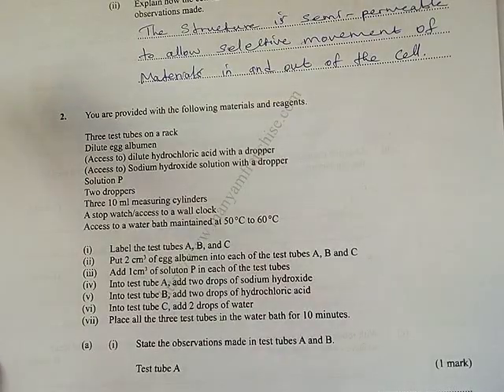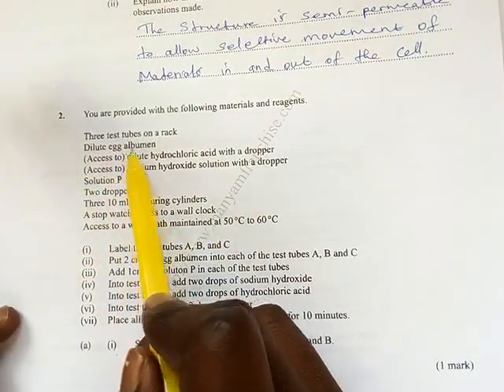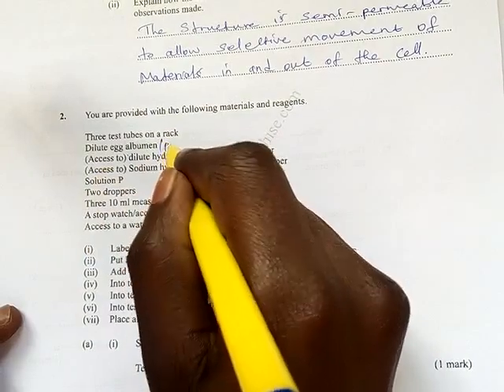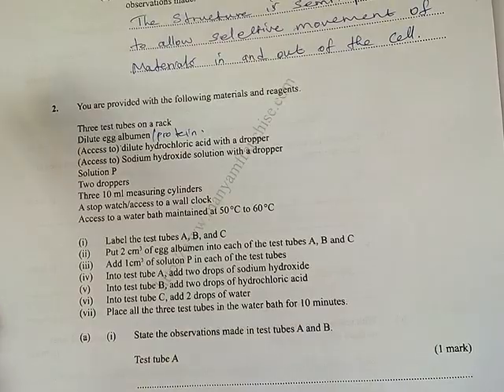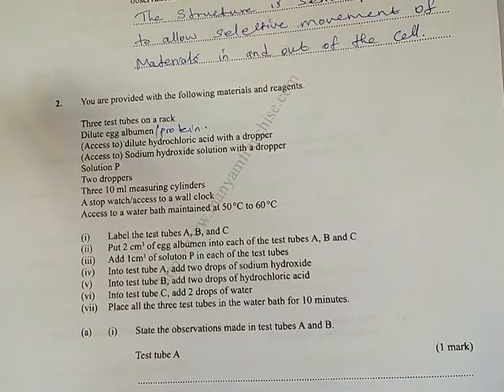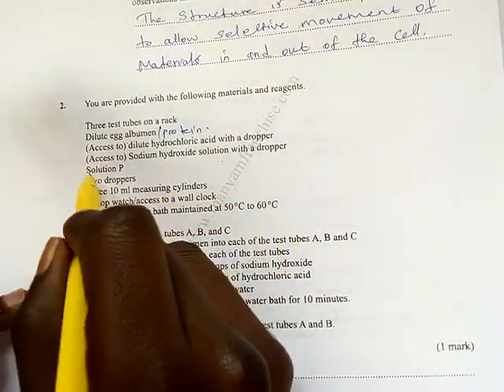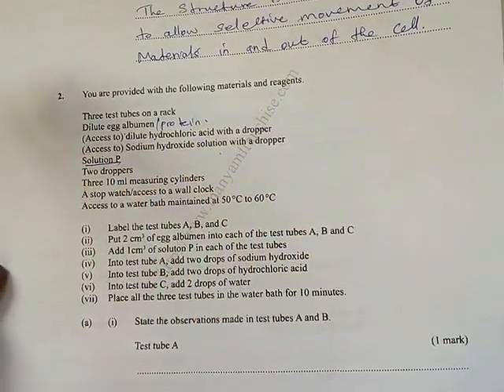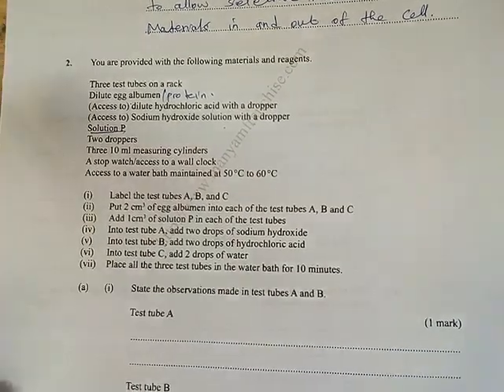In question 2, you are provided with the following materials and reagents: 3 test tubes, dilute egg albumin, this is another name of protein, access to dilute HCl acid with a dropper, and sodium hydroxide solution with a dropper. Then you are given solution P. Then you have two droppers, three 10 milliliter measuring cylinders, and a stopwatch or a wall clock.